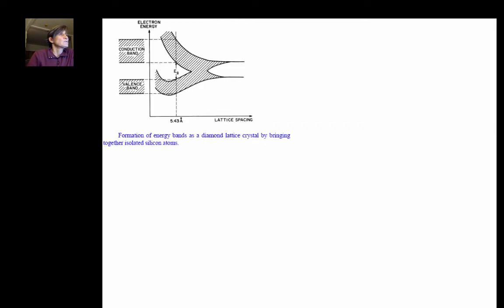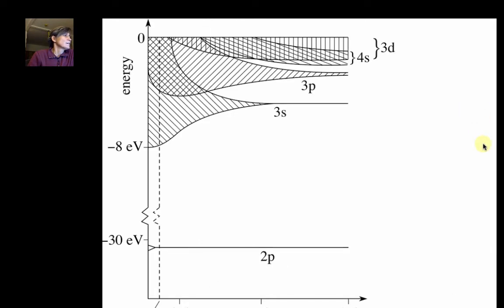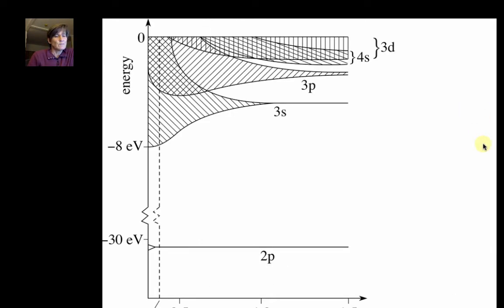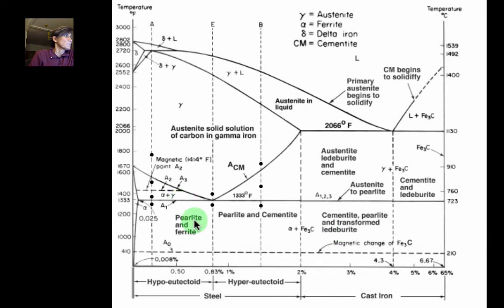Okay, so the reason why we can't detect phases or compounds is that if you look at phases, for example, in the iron carbon phase diagram, you know that you could take austenite and cool it very slowly, and it will separate into two different phases, ferrite and cementite. Or you could quench it and create martensite.